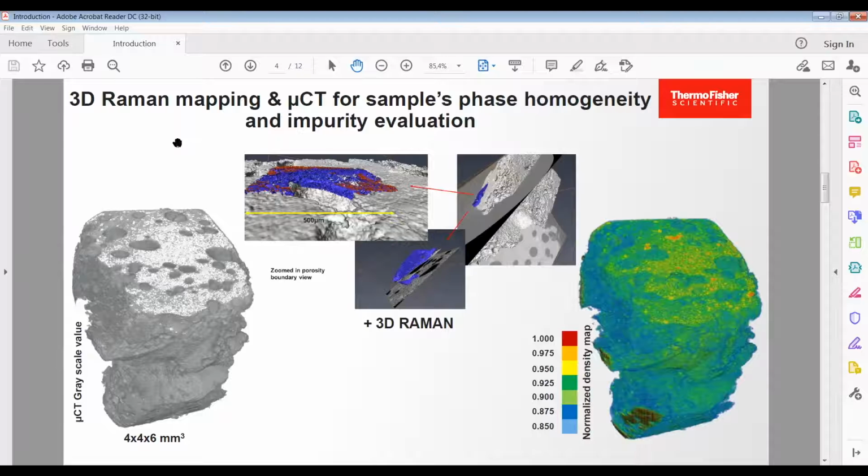Now, the problem is that the manufacturing process will necessarily induce defects in the walls, and these defects and the kind of porosities that will be produced will directly affect the mechanical properties. Therefore, the purpose of this study was to determine how we can relate the multi-scale porous media properties to mechanical variations, and after that optimize the manufacturing process.